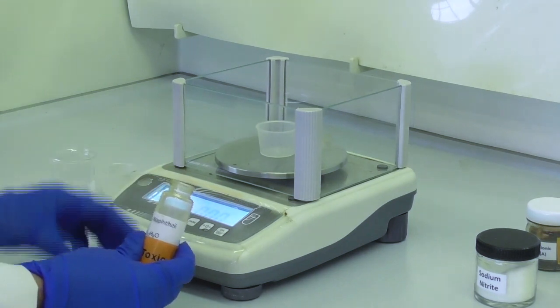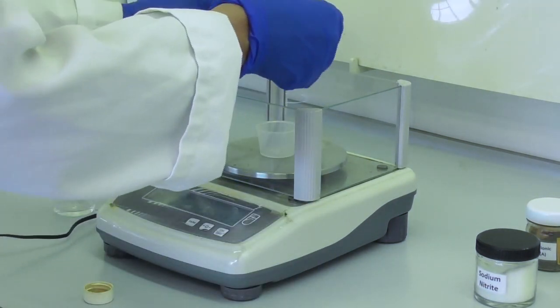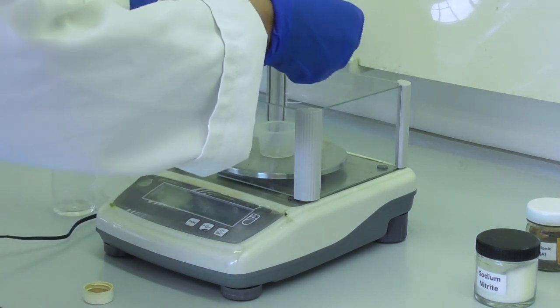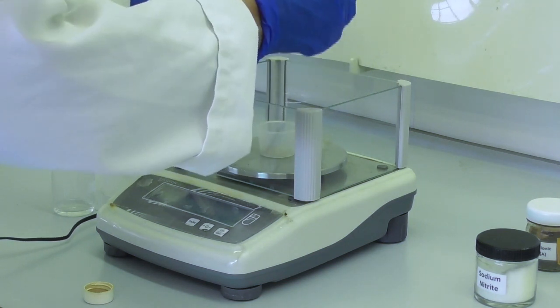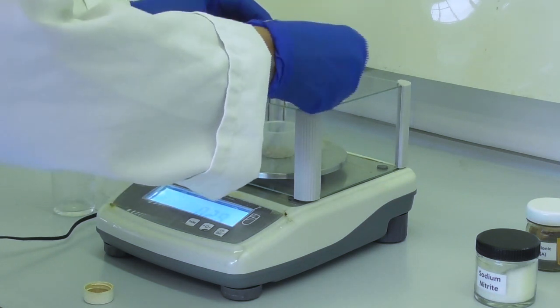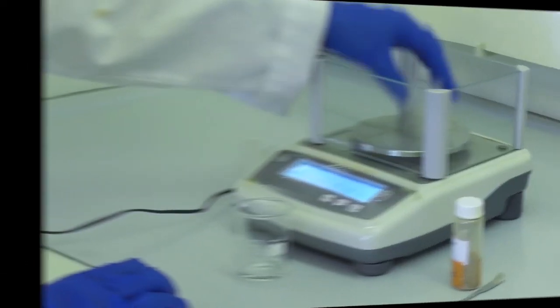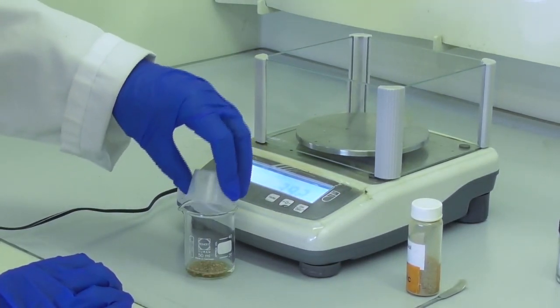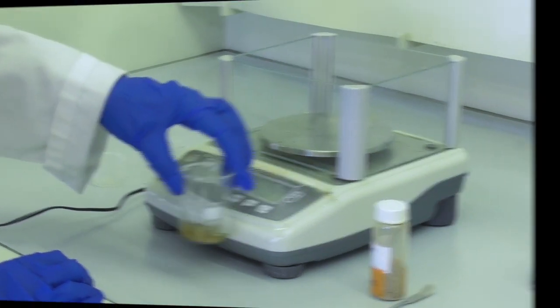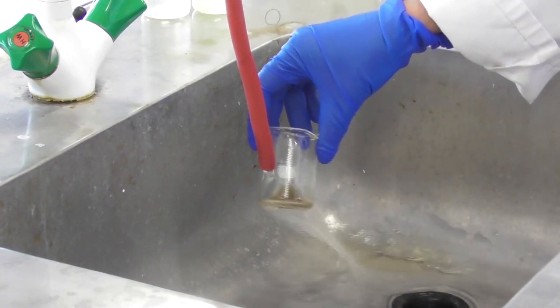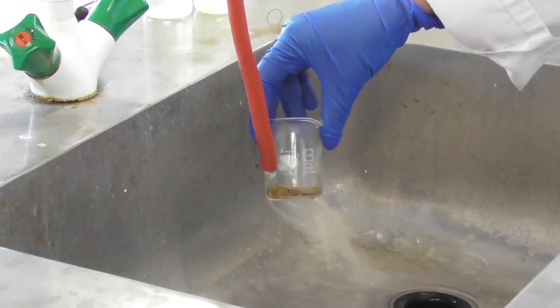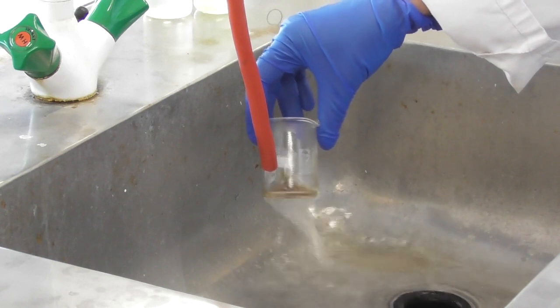In another weighing bottle I weigh out 0.40 g of 2-naphthol. I add this into my sodium hydroxide solution and give it a good swirl. As it doesn't dissolve easily I hold the beaker under a hot water tap while swirling to help the naphthol dissolve in the sodium hydroxide solution.